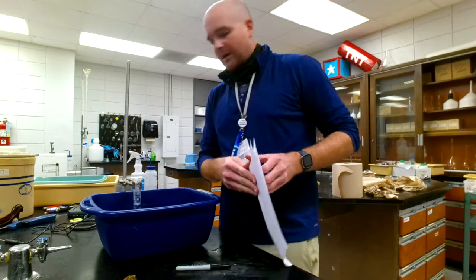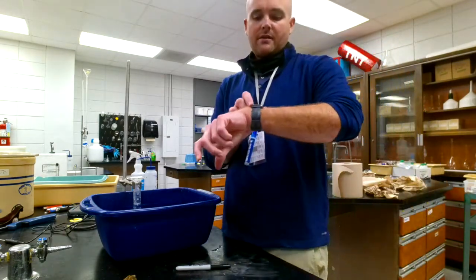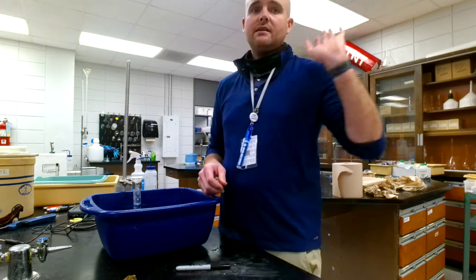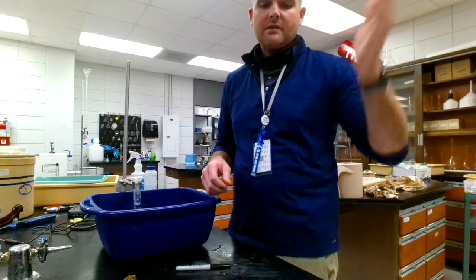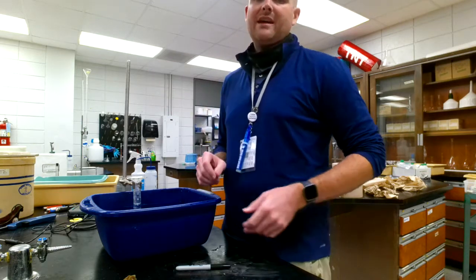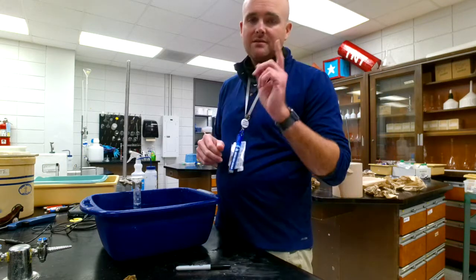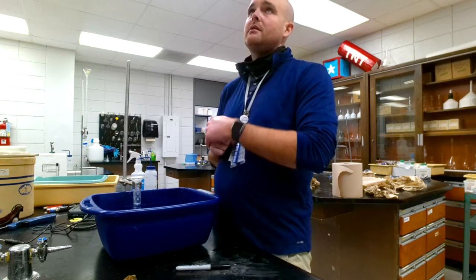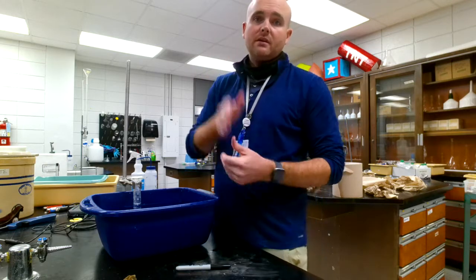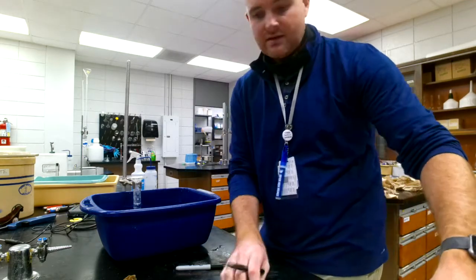Two other very important measurements to take: right now on Thursday afternoon, October 8th, 2020, Hurricane Delta is sweeping through the Gulf, and we're starting to feel some clouds. It rained a little bit today, so the barometric pressure is a little higher than normal. It's 29.95 inches of mercury. That is somewhere around 101 kilopascals. Why don't you go ahead and look up a unit converter and convert that? That's what KBTX says. There's my reference, KBTX. Thank you, weather.